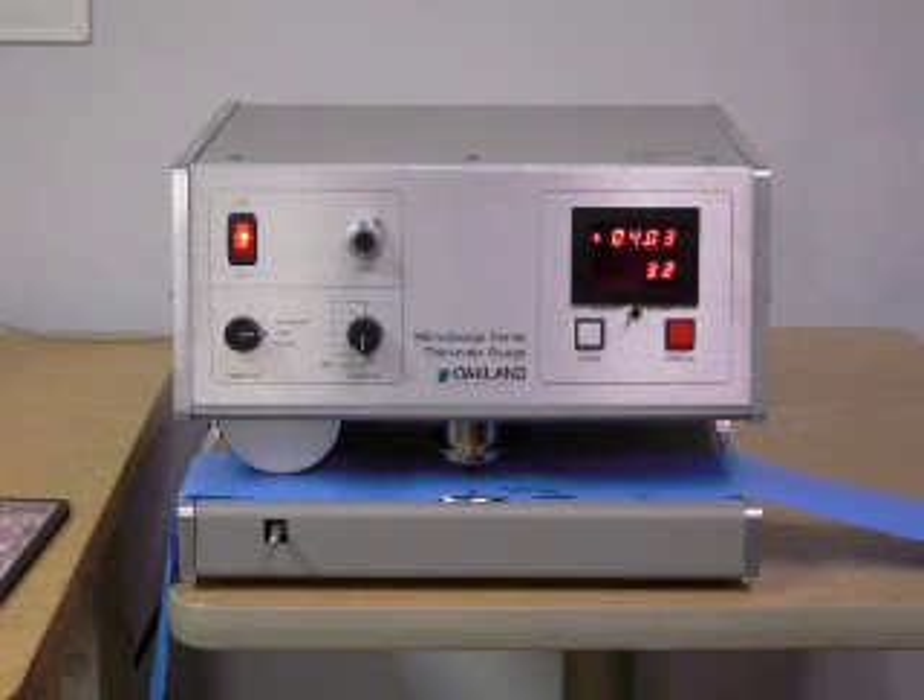The Oakland Instrument MX series micro gauges are offline thickness testers placed on a work bench or lab bench where the operator cuts and prepares samples from the production line to run on the system. Models are available that can automatically feed or pull the sample strip through the tester for profiling, or manual models where the strip is hand-fed under the measurement foot for single readings or cross web readings at multiple locations.